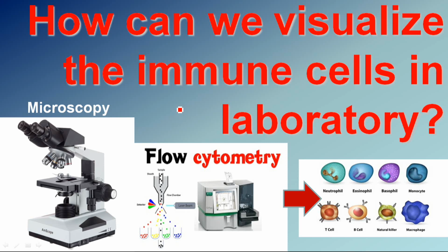Hello friends and viewers. Today I am going to talk about how we can visualize the immune cell in the laboratory, because we are working in the laboratory and we know how this cell looks like in the microscope and in the flow cytometry, but most of the people do not have access to these machines and they do not know how actually they can be seen in the laboratory.